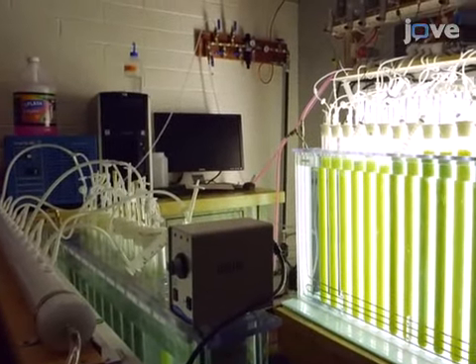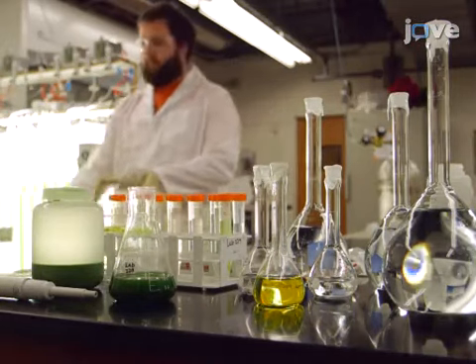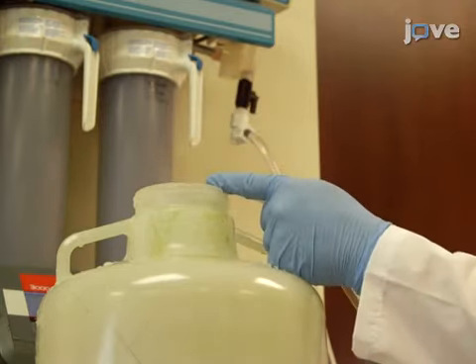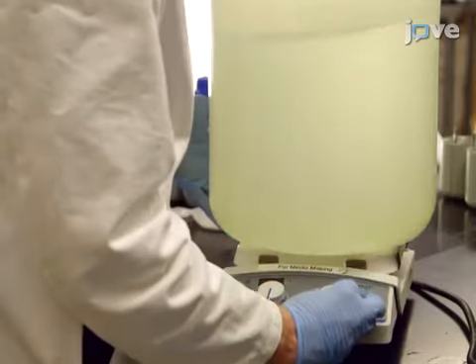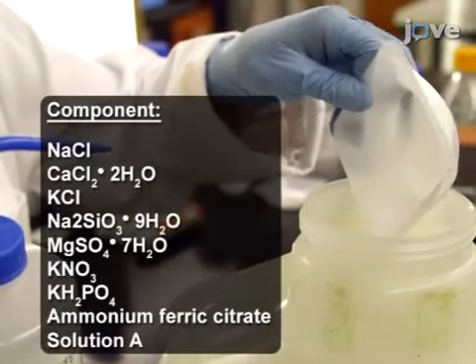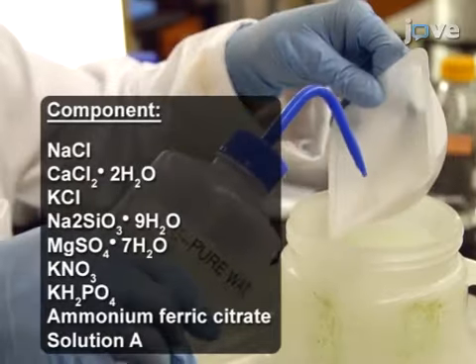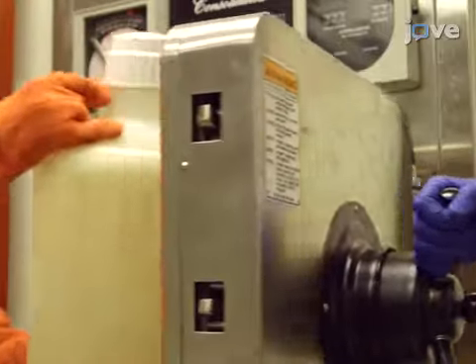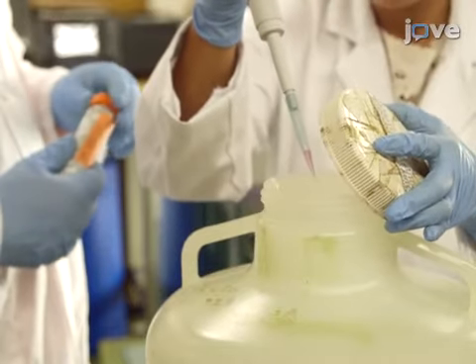After building the microalgae experimental growth system and preparing labware according to the text protocol, partially fill a 20-liter autoclavable container with deionized water and insert a magnetic stir bar. Place the container on top of a magnetic stir plate, and one at a time add the chemicals shown here, allowing each to fully dissolve before adding the next. Autoclave the medium at 120 degrees Celsius for 30 minutes and allow it to cool to room temperature before adding the vitamins.